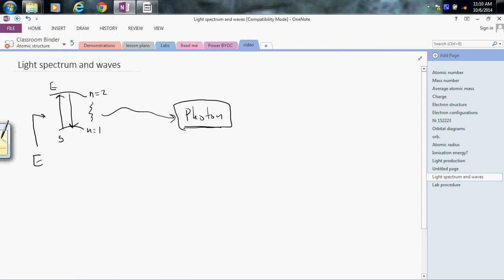So in our lab, we're going to be heating something with Bunsen burners. Now, a Bunsen burner, okay, my little Bunsen burner, got a little flame here. Not a very good Bunsen burner, but we're going to heat something with this Bunsen burner. So this is the amount of energy that we're putting into it. So the light that is given off, the photons, really can't have any more energy than what the Bunsen burner is providing. So if I want a higher energy photon, I'm going to have to put more energy in to either ram it up higher or to do other things. Either way, I'm not going to be able to get more energy out than I put in.